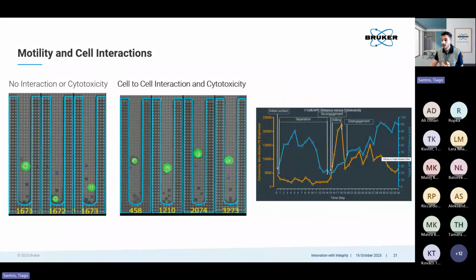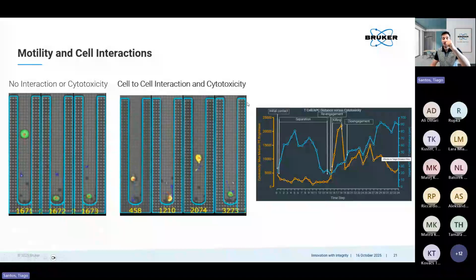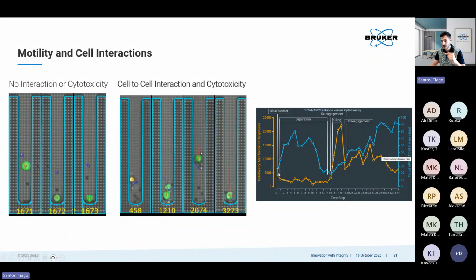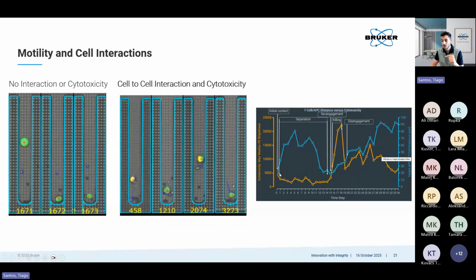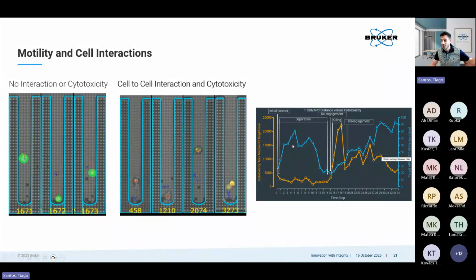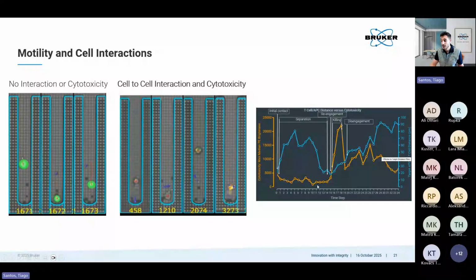As you can see, once again, thinking about the cytokine secretion assay, we place the T cell really close to the cancer cell right at the beginning. So there's contact. But then there's separation. The T cell moved away. So yes, there was contact, but there was no killing at this moment. There's no increase of fluorescence of the caspase-3.